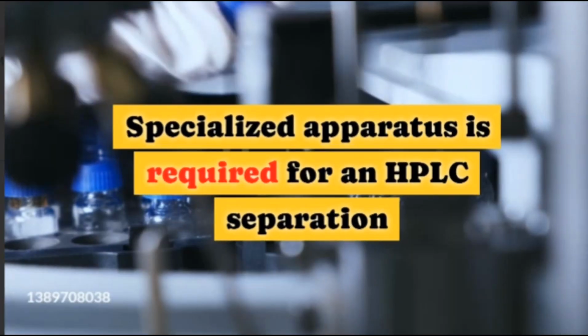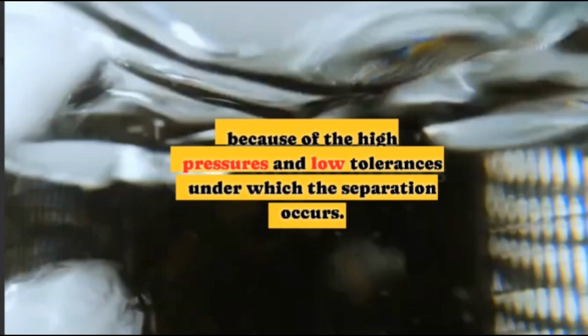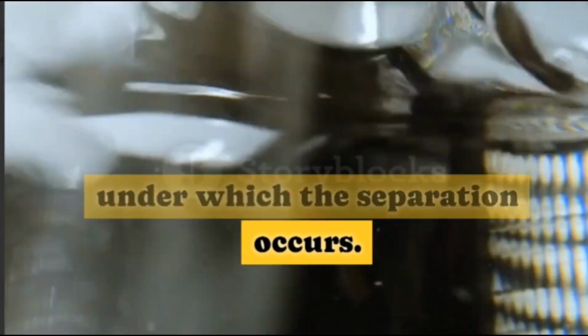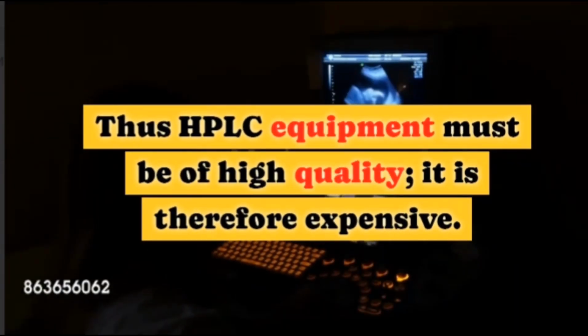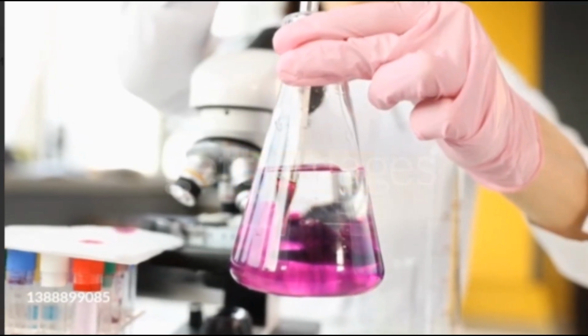Apparatus. Specialized apparatus is required for an HPLC separation, because of the high pressures and low tolerances under which the separation occurs. Thus, HPLC equipment must be of high quality. It is therefore expensive.